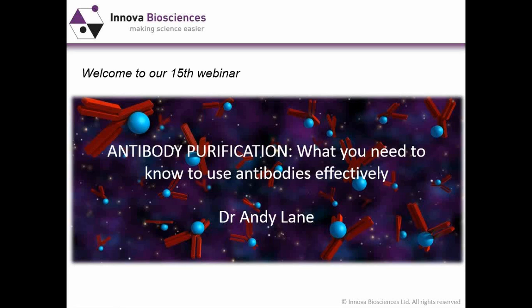Today's webinar, Antibody Purification, What You Need to Know to Use Antibodies Effectively, will discuss the various methods available for purifying antibodies from different sources and explain why it is vitally important to understand how your antibodies have been purified, to know what you can do with them, either within assays or for further processing such as conjugation to dyes and enzymes.